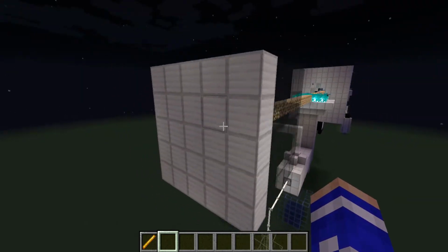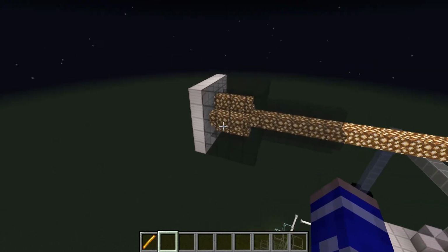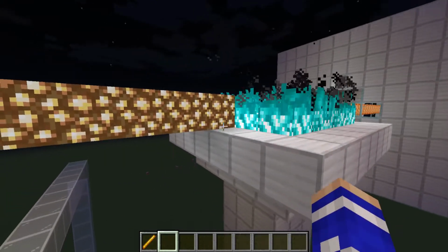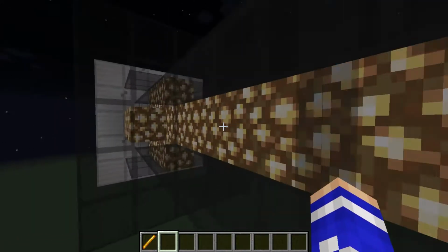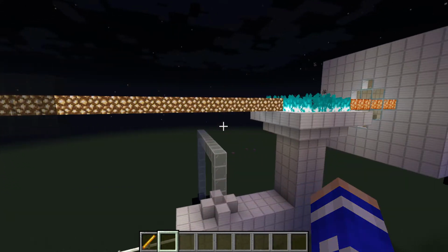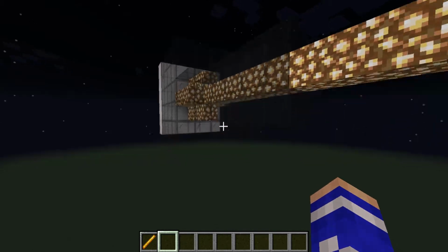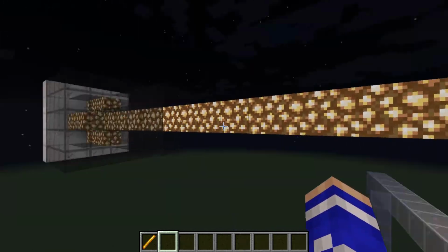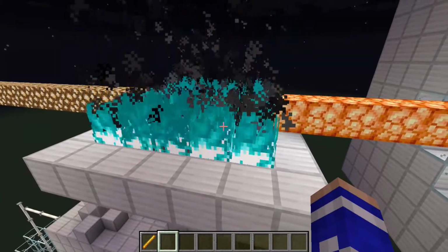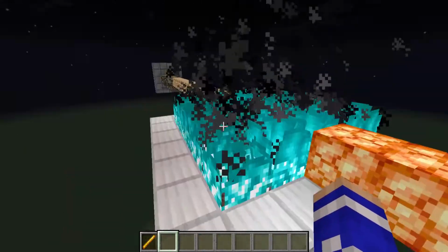So the main important thing about AAS is the use of this hollow cathode lamp. This is important because we are analyzing for a specific element, and each element has a specific cathode lamp that has to be used. So the cathode lamp is turned on, the beam travels through the flame where it interacts with the calcium molecules, and some of that light is absorbed by the calcium.